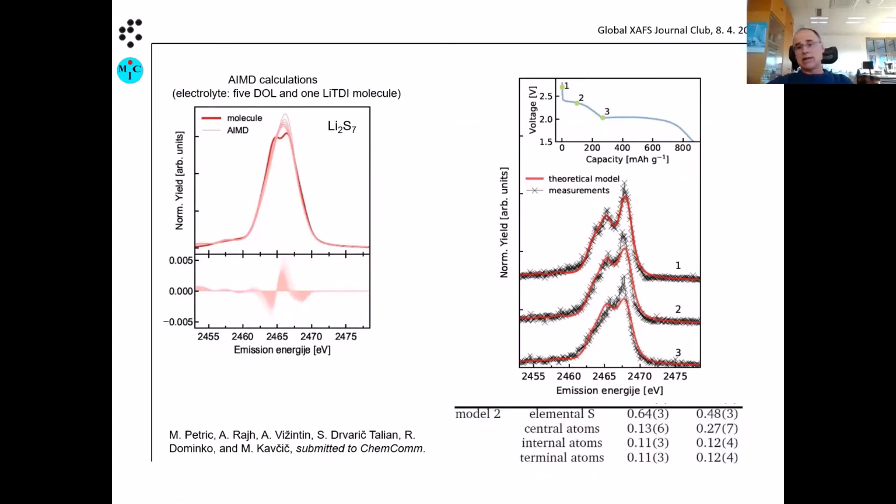They are okay, even with this amount of different atoms. This is a little bit too much, and it's not exactly what one would expect. But at the moment, we focus on this first line, and this gives, in fact, a good measure of the process that has been performed in the battery.